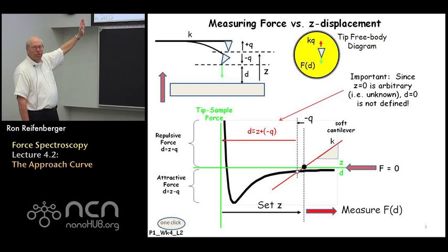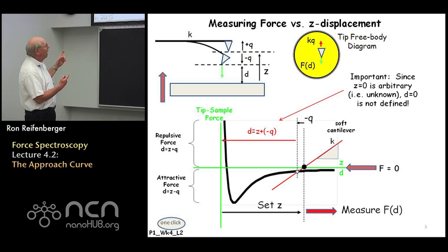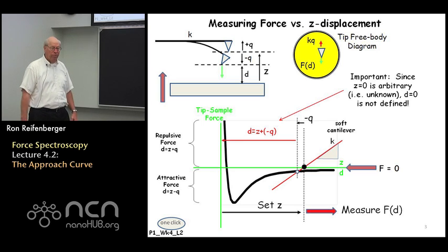So one of the problems in discussing this in a systematic way is that there are different conventions for setting D equal to 0 in these force plots, and we'll try to make our convention clear as we work through the discussion. So this is an important slide. It sets up the rest of the lecture. If you understand what's going on here, then you shouldn't have too much difficulty following what I'm going to say in the next 15 minutes or so.